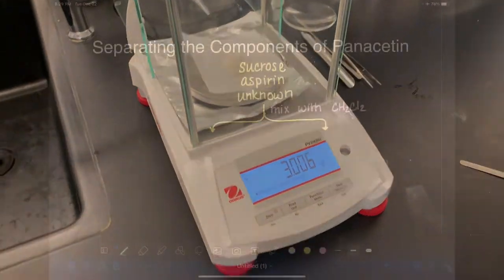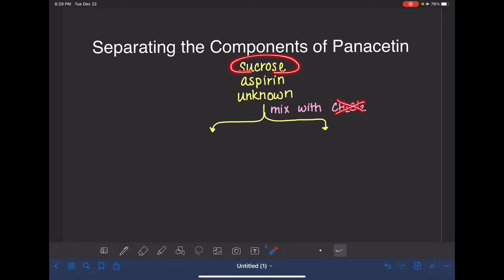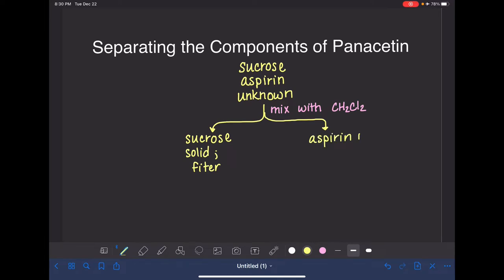Here's our starting mass. Panacetin is a mixture of sucrose, aspirin, and some unknown chemical. In our first step of separating them from each other, we're going to take advantage of the fact that they have different solubility in a solvent, CH2Cl2, which is known as methylene dichloride or dichloromethane. Sucrose is not soluble in methylene dichloride, so if we mix our panacetin with it, the sucrose will not dissolve — it will stay solid — allowing us to filter it out. The aspirin and the unknown will dissolve in the methylene dichloride, and we will have to separate them from each other in a second step.